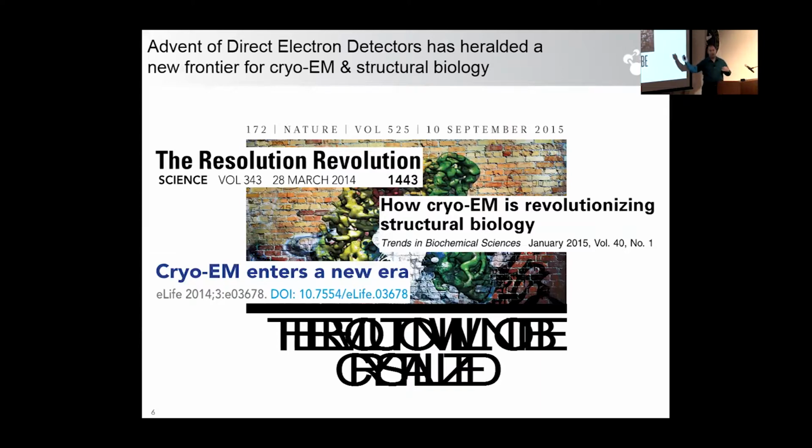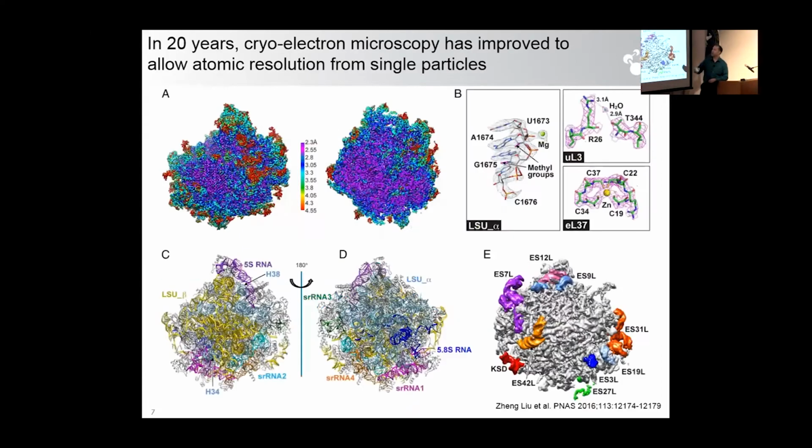In the last 70 years since electron microscopy was developed, you wound up working with film or with CCD cameras, where you would image your sample by having the electron hit a phosphorescent screen and create light. That light gets tunneled to a CCD camera, and you're actually recording the light. Instead, with direct electron detectors, now you can actually image the impact of each individual electron. So you have much clearer data. And because of this, you can now get truly atomic structures from individual particles and individual complexes.